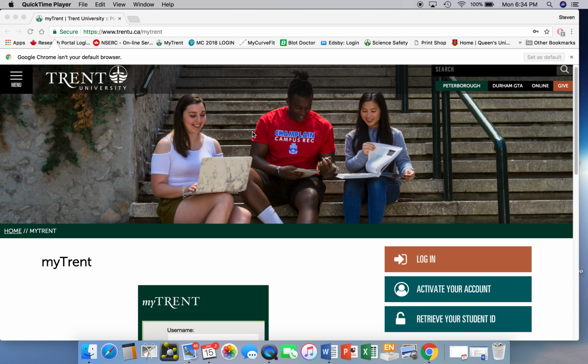Hi, and welcome to the first Chem 2300 seminar, where you're going to learn how to use the Protein Data Bank to not only retrieve structural files, but to view them.